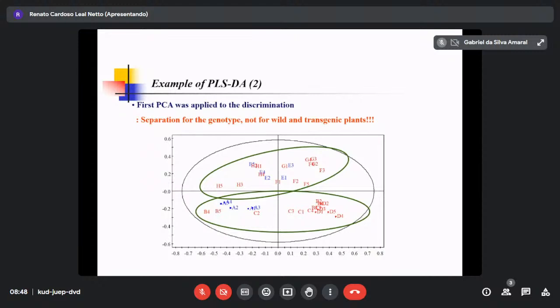That is very good. What kind of validation test? Basically, the simplest one is the permutation test. Have you heard about the permutation test? What's the permutation test? You change the original classes, and you make the model understand that they're different, but actually they are not different. You just swap the classes, and you can try 10, 100, 1,000 permutations to see if it is still significant.